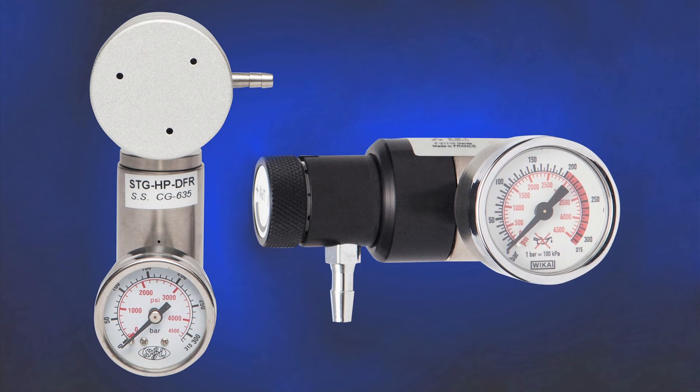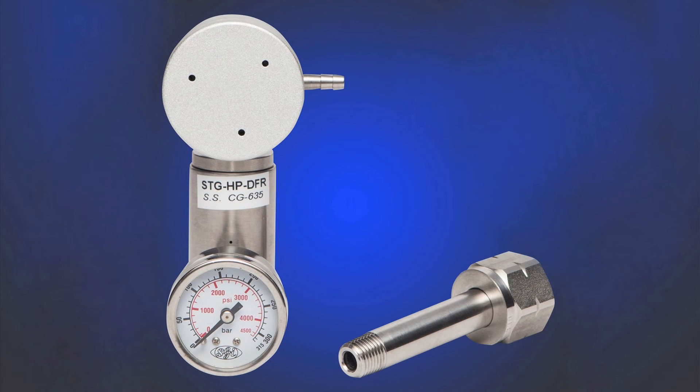Our second group of regulators are flow regulators. This group includes the ODFR-1001HP on-demand flow regulator and the VAF-100HP variable flow regulator. Both are available in nickel plated brass or stainless steel. The ODFR-1001HP is used for applications where the instrument or calibration system has its own internal sampling pump. The ODFR opens as a vacuum is created and the gas flows based upon the sampling pump flow rate. The regulator has a 0–3 litre per minute range. This is an excellent regulator for those calibrating gas analysers where flow is required or docking station systems.